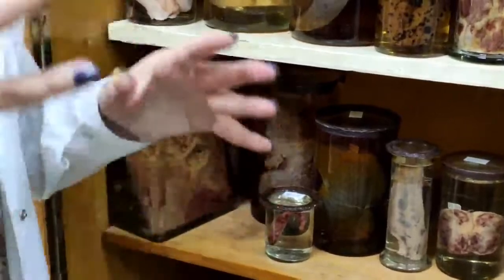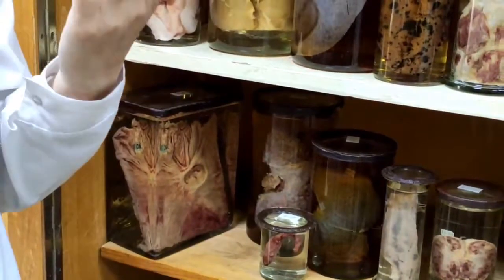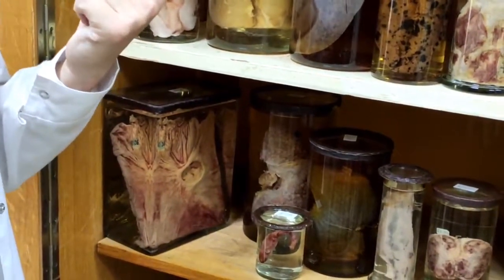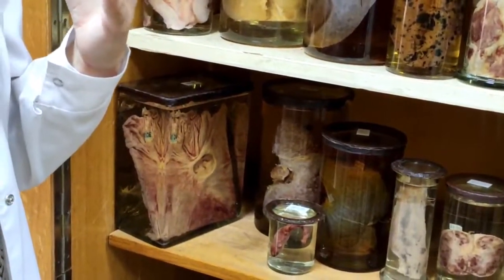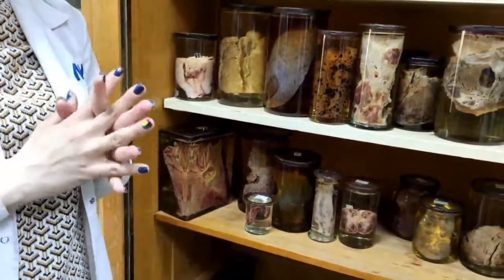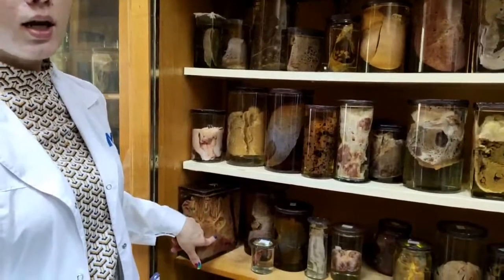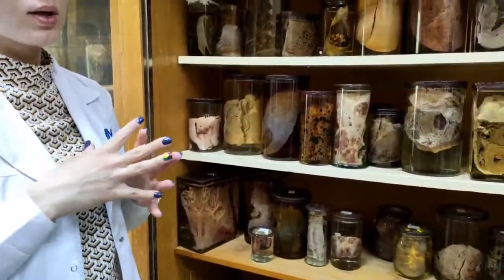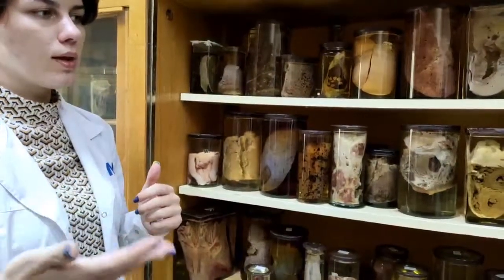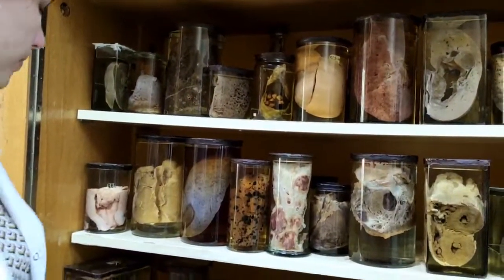Ulcer is characterized by a deep defect in the wall of the stomach. It can be quite deep. Sometimes we can see an ulcer which affects the wall until the muscularis propria or even the serosa, and that is why there are different complications of ulcers, for example, bleeding, penetration, perforation, or healing. Even maybe 1-2 years later, we will see this defect because an ulcer heals with scar formation. Erosion heals without any scar formation.